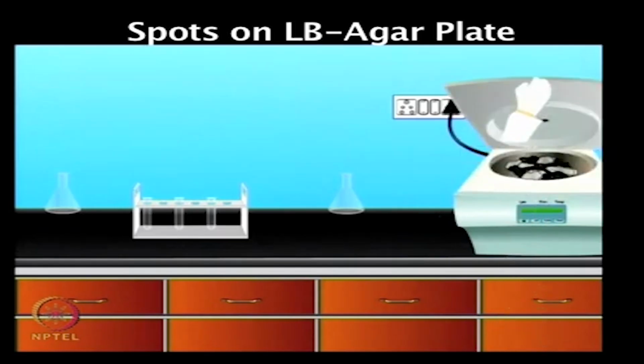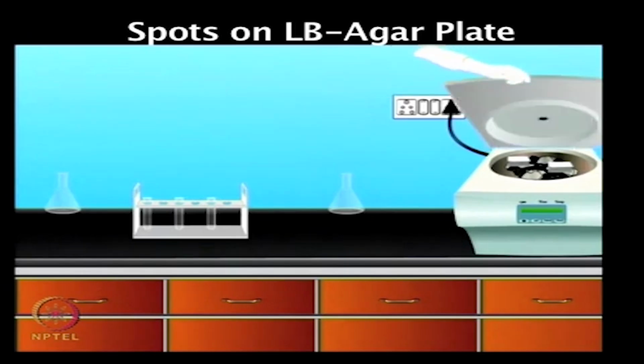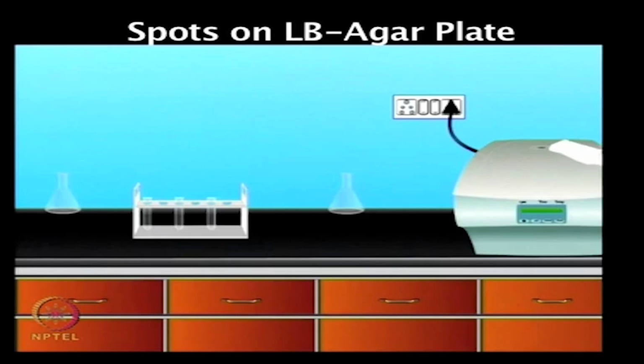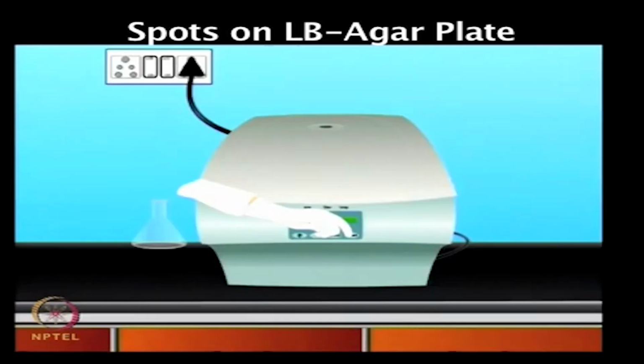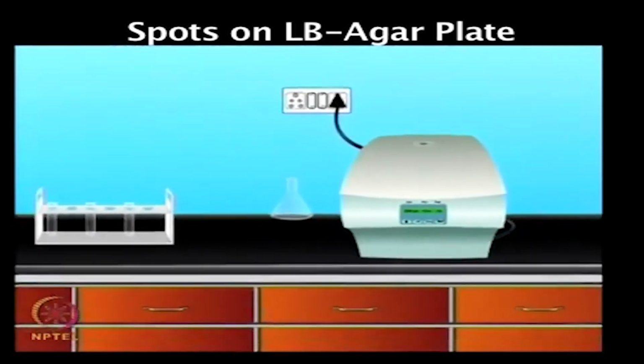for the overnight or 10 to 12 hours of incubation, then we need to pellet down these blocks. So, you can centrifuge these blocks for 15 minutes at 2000 to 2500 rpm. While doing centrifugation, ensure that the centrifuge is balanced. So, once the centrifugation is complete, then the bacterial pellet will be in the well and then you need to remove the supernatant.